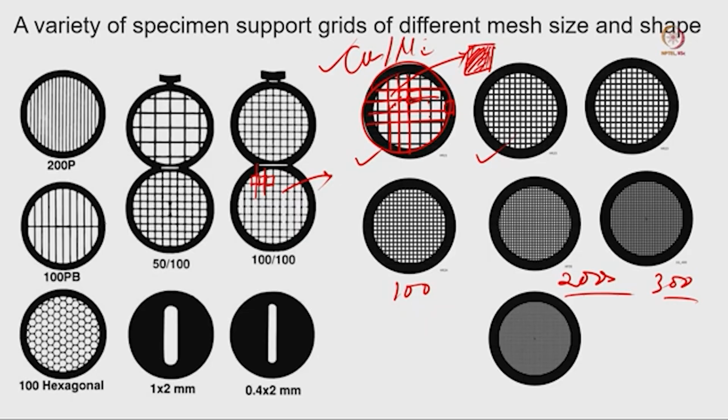Now I will show you one diagram or animation image of how we are inserting the holder inside the microscope. Before that you have to understand how that holder is working, so let us take a look. This is a column, and you cannot see inside that column because it is not transparent. Outside will be a very thick metal covering it, so you cannot see anything inside.